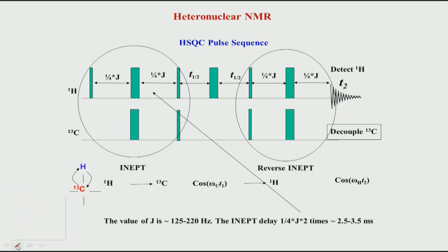Let me show you one thing which is very important to know here. In a molecule we have this combination and this combination. This one is about 99%, because the natural abundance of C12 is 99%, and this is 1%.